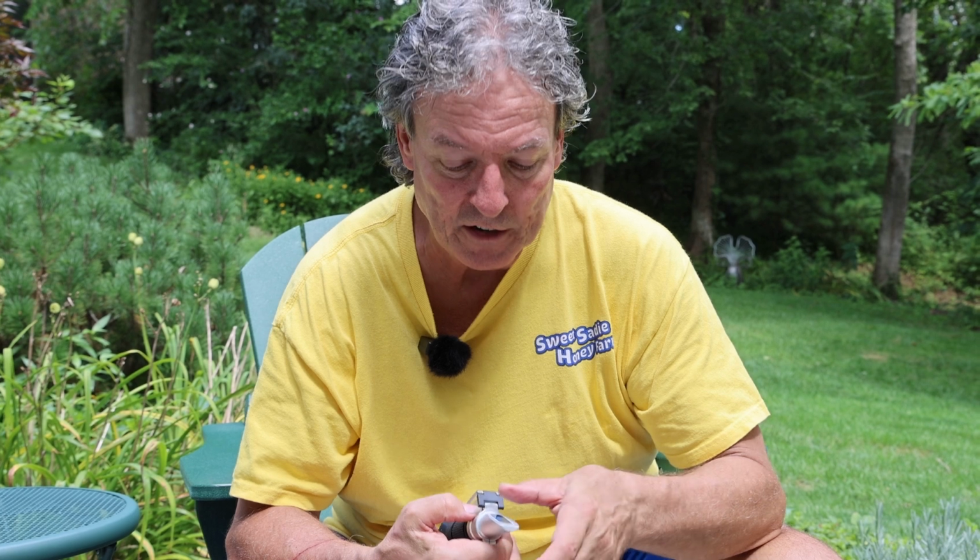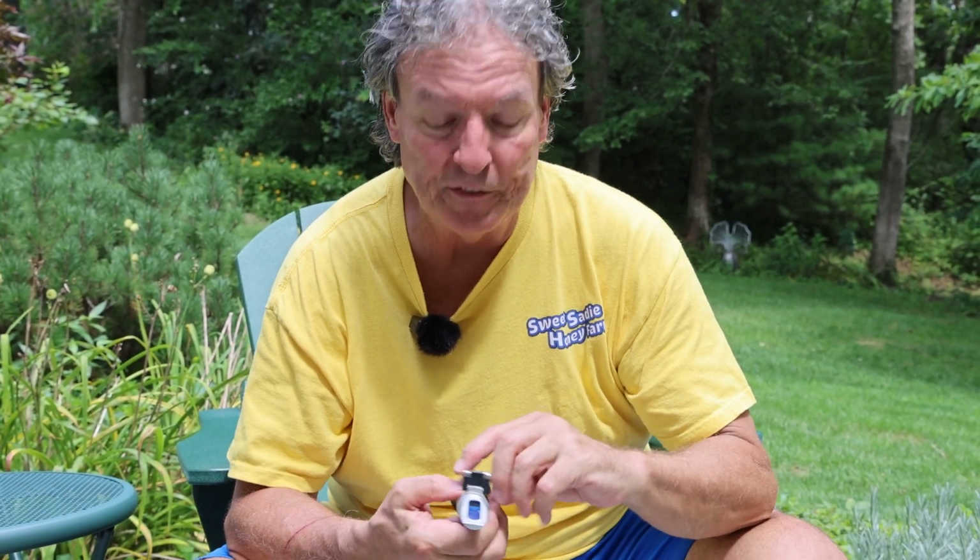Put your little cap back on, clean your refractometer. I usually use distilled water, but you can use just regular water and a soft cloth. Just get it completely clean and completely dry, and then you're good to go.